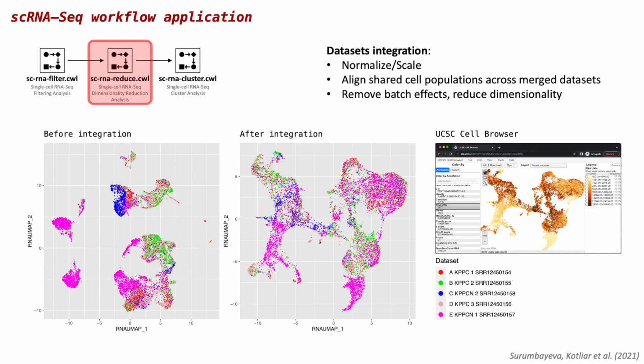Two plots shown here display UMAP before and after running datasets integration. The main idea of this step was to make cells that have similar gene expression profiles appear in the same area on UMAP even if they came from different datasets. That's a required step for proper cell type identification. On the right side of the slide we can see interactive visualization based on the UCSC cell browser. It can be used for assessment of integration results.